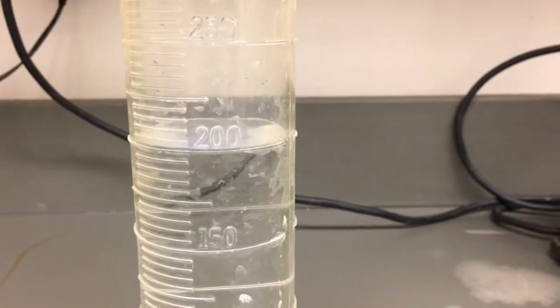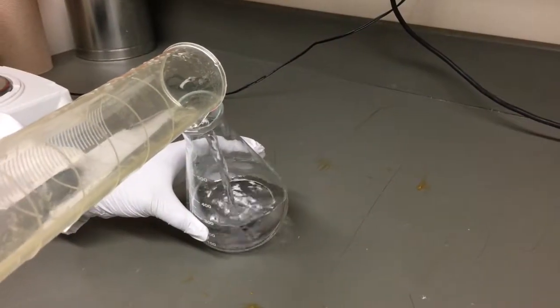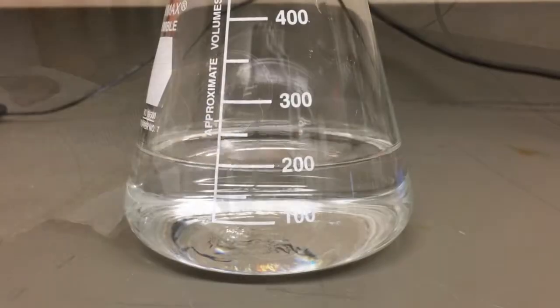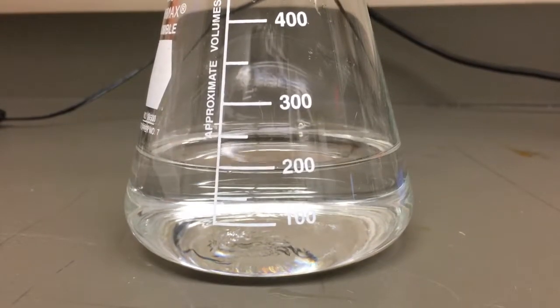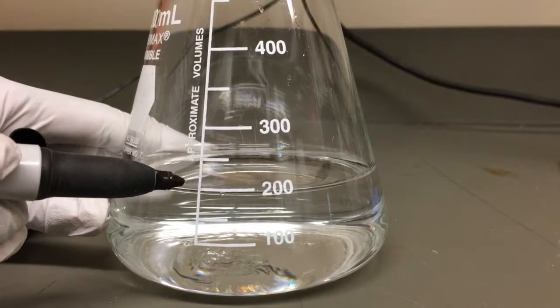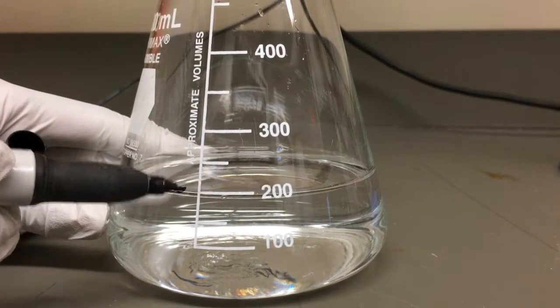Verify the correct volume to be prepared using a graduated cylinder, as volumes on beakers and Erlenmeyer flasks are only approximate. Pour measured water into the flask and mark the fill line. If more precise measurements are required, a volumetric flask must be used.